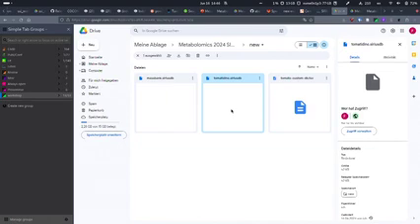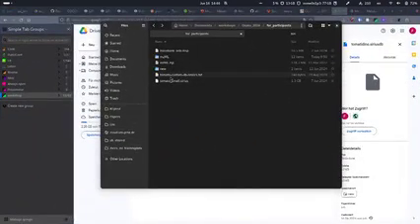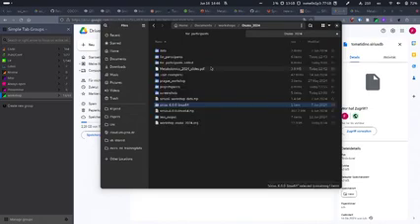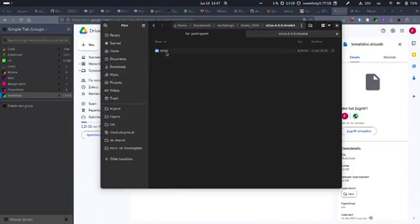But first, if everybody has SIRIUS downloaded and extracted and installed, depending on your operating system, let's just start it up. If you have the SIRIUS folder on Linux, you mostly get a zip file which you can extract, and in this folder you will have a SIRIUS folder, and there's a bin folder for the binary data, and there's just one SIRIUS executable which you can just run. I think on Windows, if you have installed it with an MSI file, you will just have an icon on your desktop or in your start menu or somewhere.